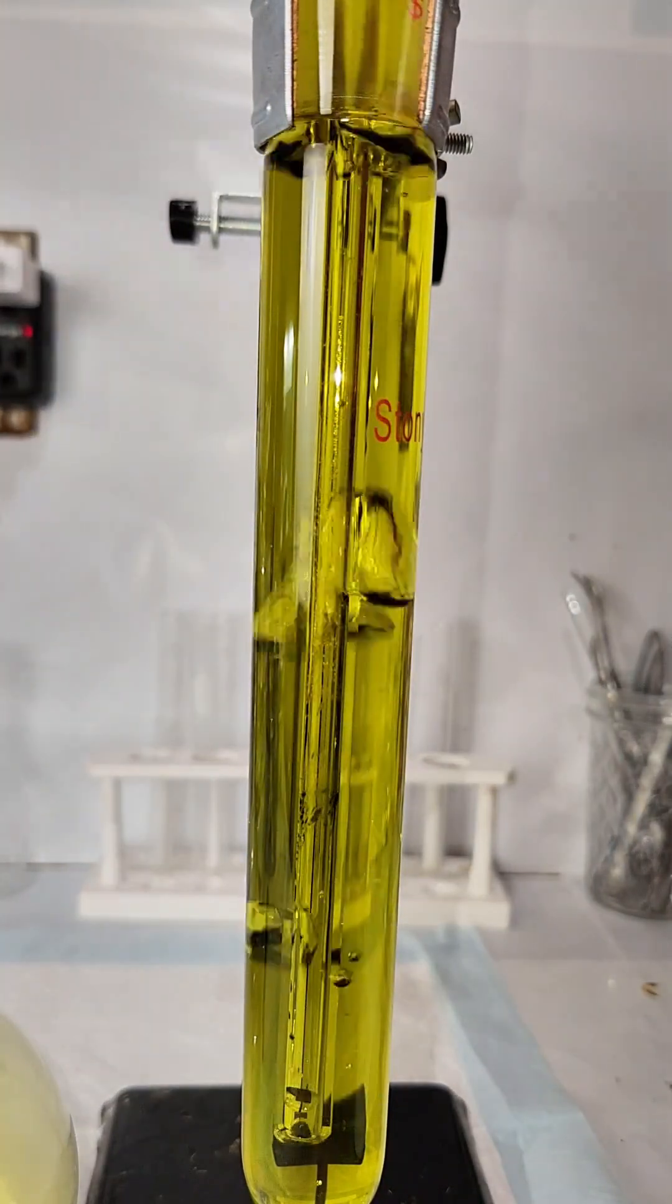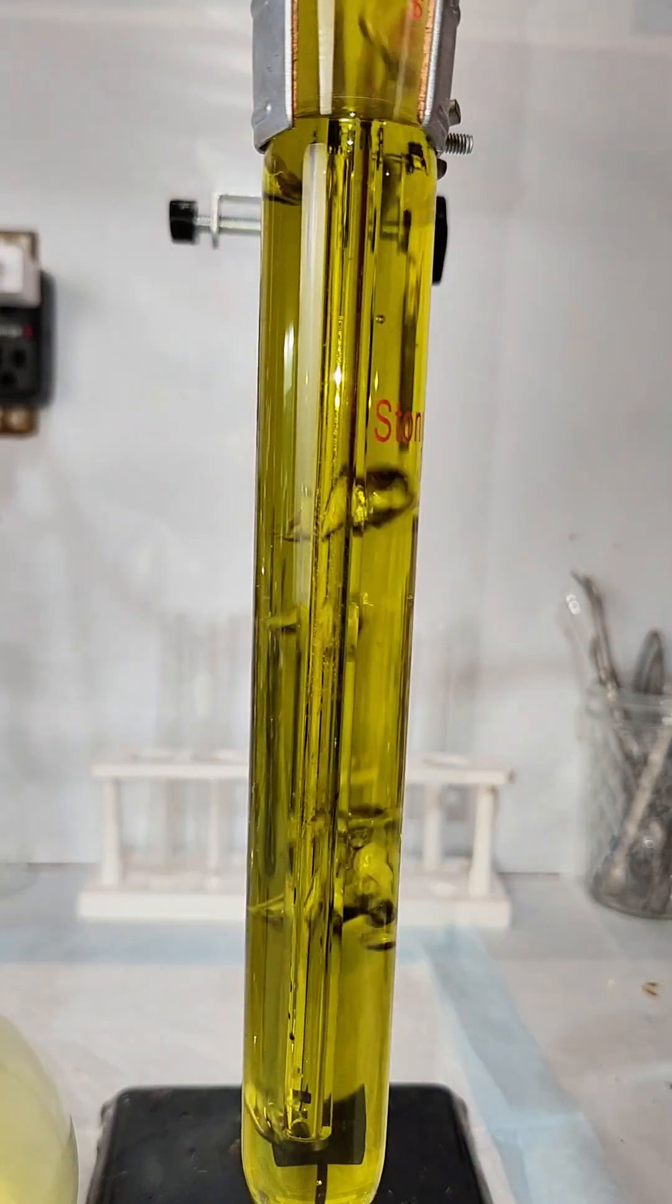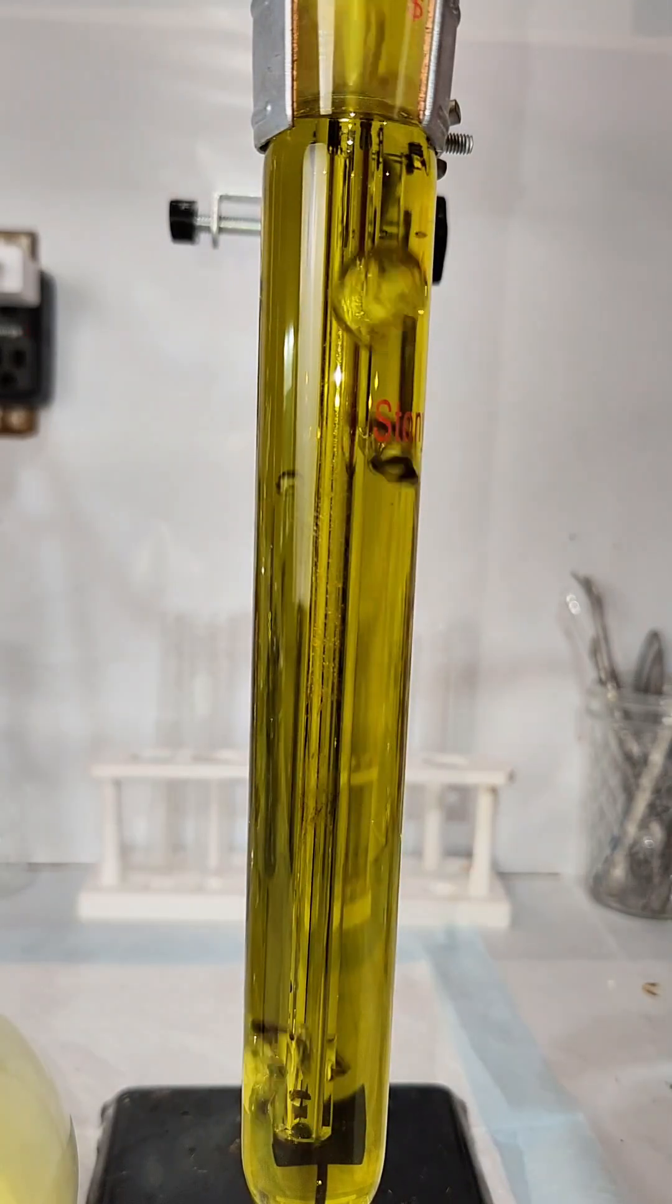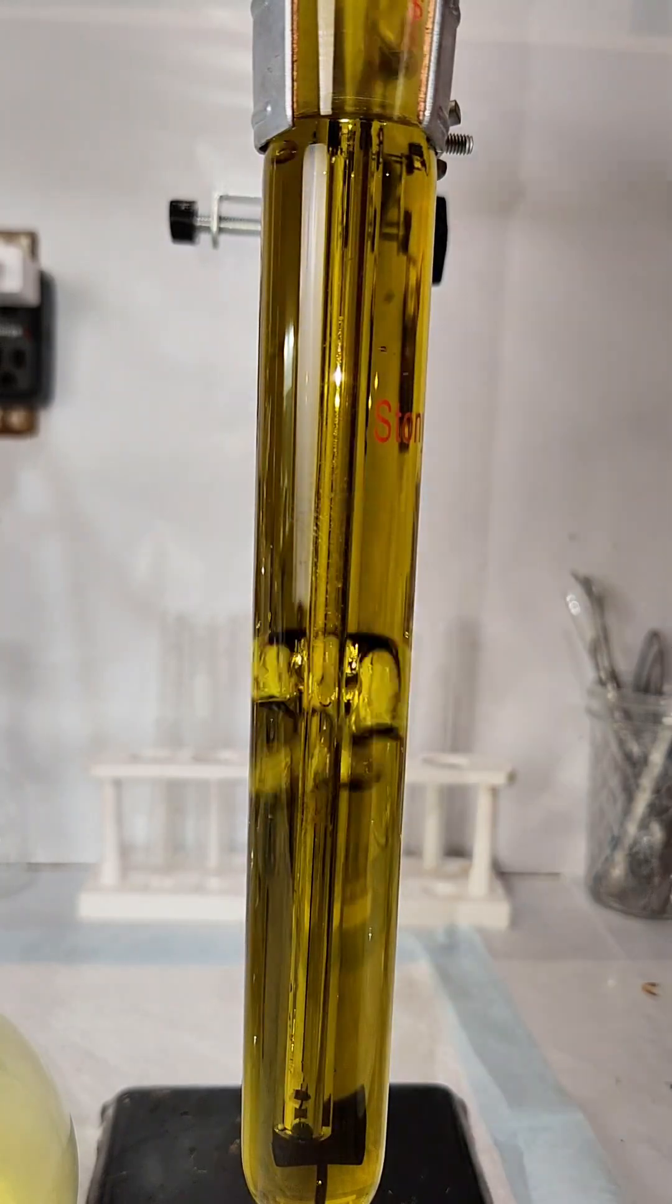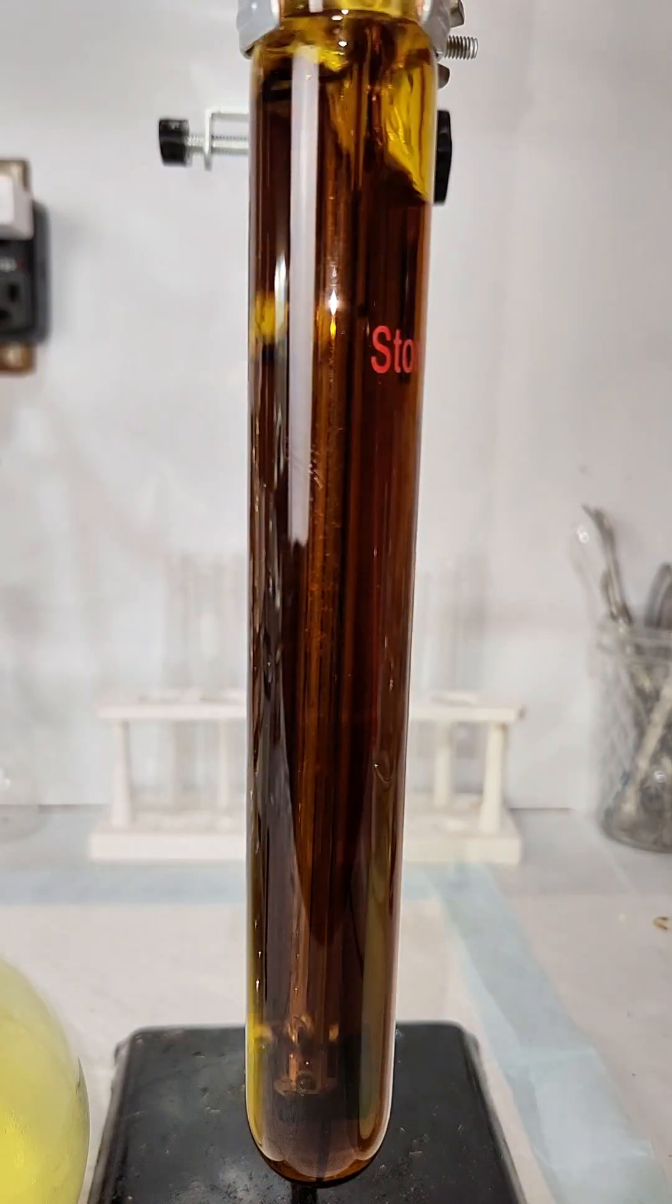Eventually, it'll change from this pale yellow color to a deep red, and it used to be named after that. Specifically, ferrocyanide was referred to as yellow prussate, while potassium ferricyanide was referred to as red prussate.